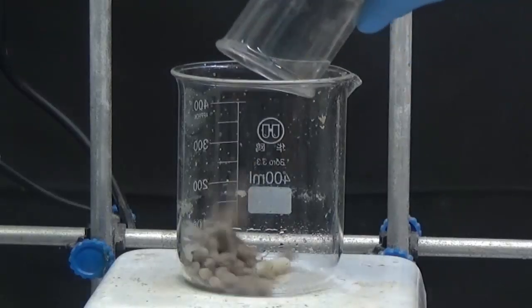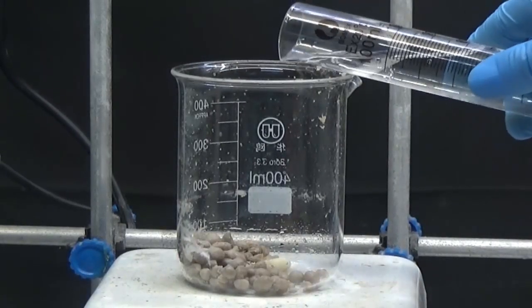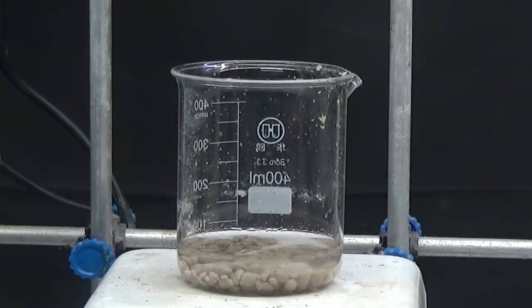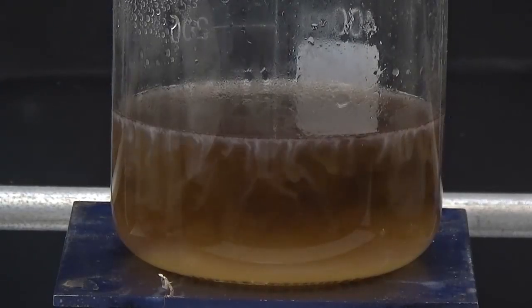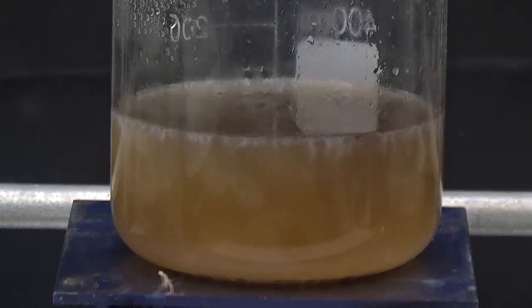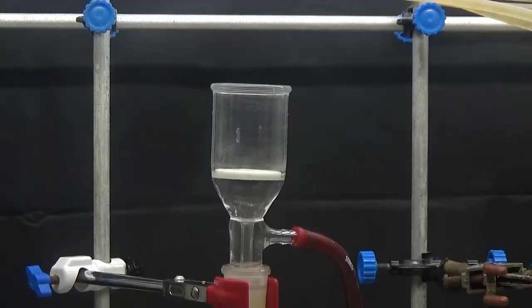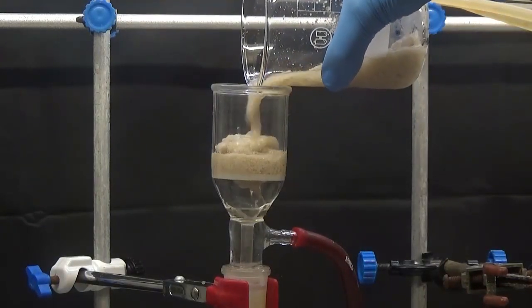To purify the obtained furfuryloxime, dilute in 100 milliliters of hot water. Leave to cool with slight stirring. Collect the crystals by suction.